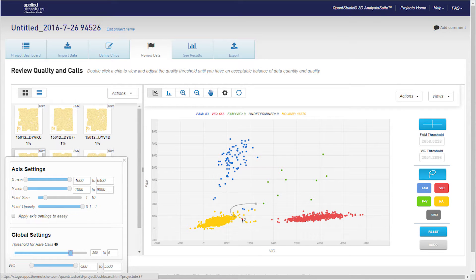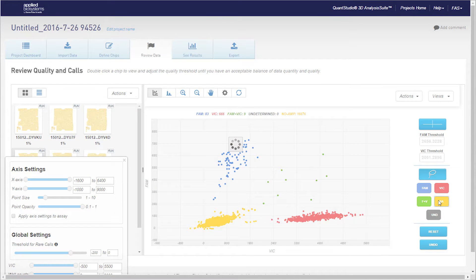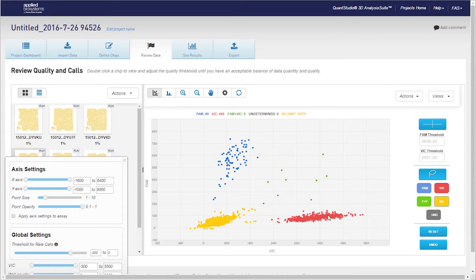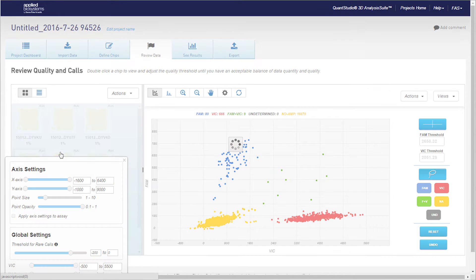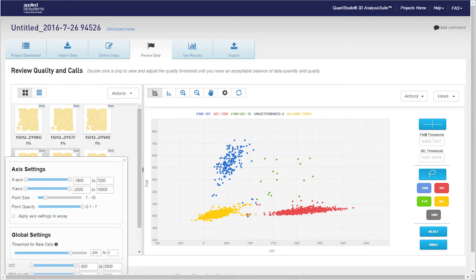After you set the global setting, if you desire, review each chip and adjust the calls as necessary using the lasso tool or the thresholding crosshairs. Then, if you have replicates, you may want to overlay them to check the calls and fine-tune as necessary.